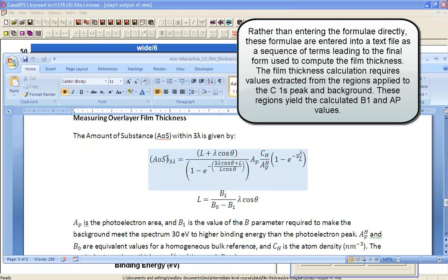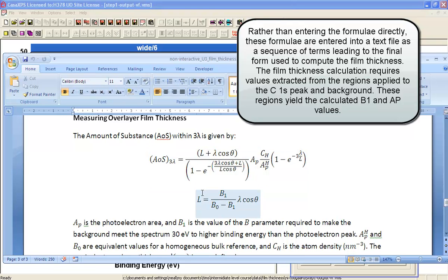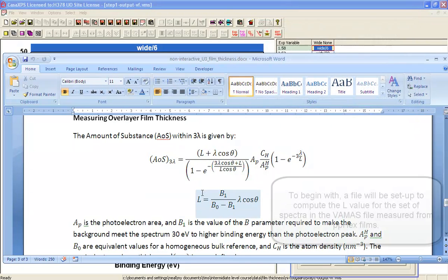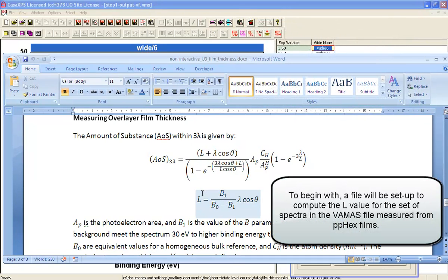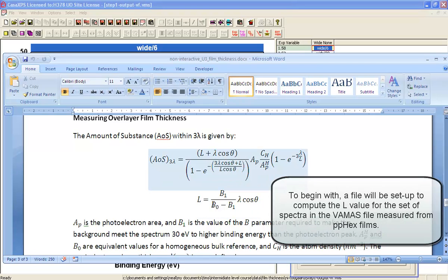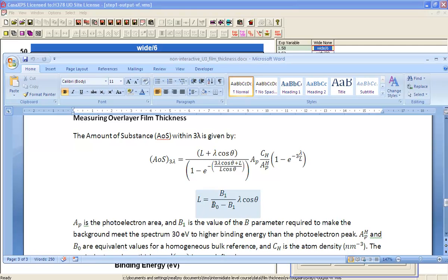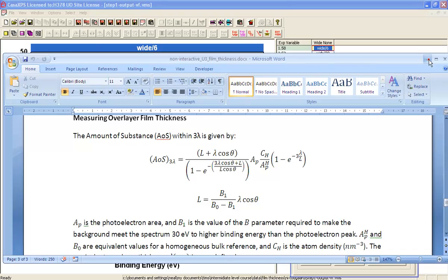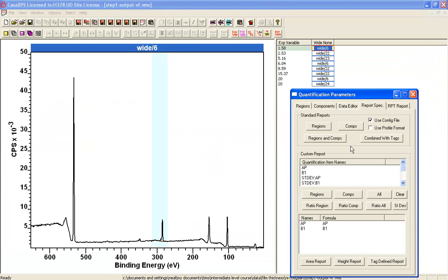So the formula that we're interested in entering is this one here and also uses this one here for the L. So we want the amount of substance and the L parameter which will feed into the amount of substance, and together they will give us the film thickness provided we can create such a formula.